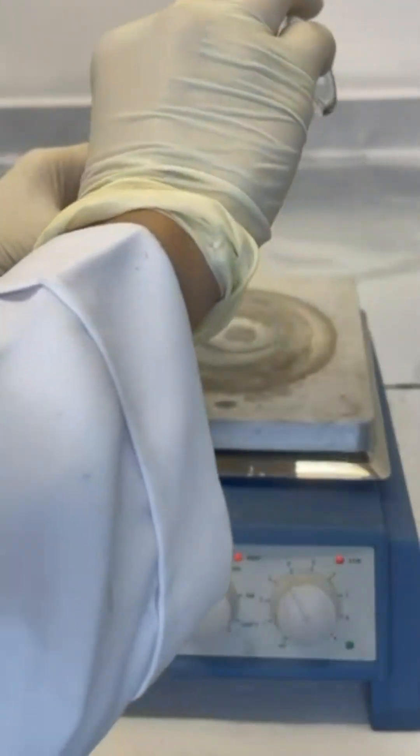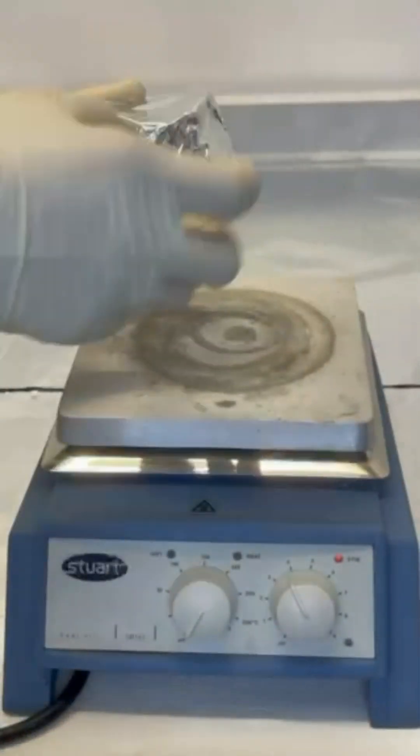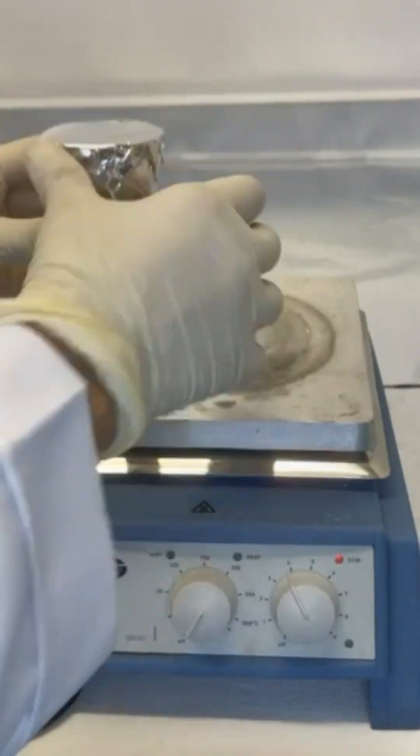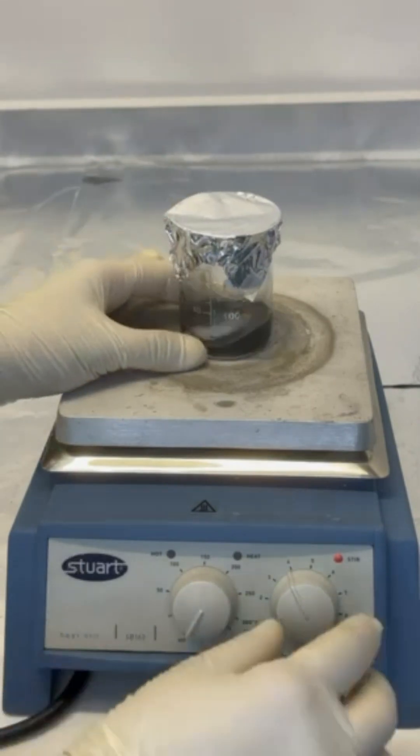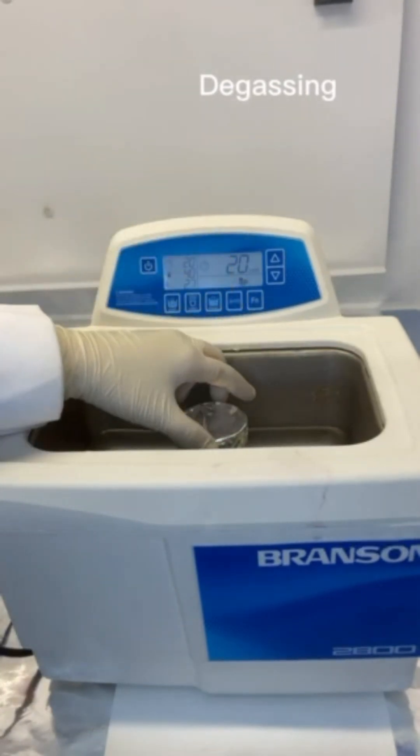Mix polymer with the filler and stir for an hour. Put the mixture into the degassing for 20 minutes to remove the gases.